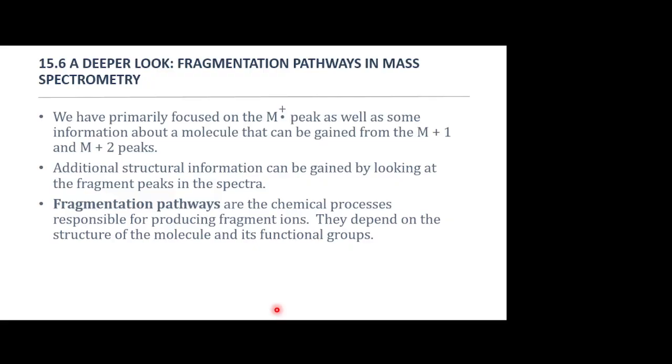Okay, so again, we've primarily so far focused on our M plus peak, with a little bit of information on the isotopes on that peak, right? We've essentially ignored the rest of that molecule, ignored all the fragments, ignored all the fragmentation pathways. So if we want additional information about our molecule, that's where we're going to have to look, and we're going to have to start using those. Now, we can get a lot of additional information, in fact.